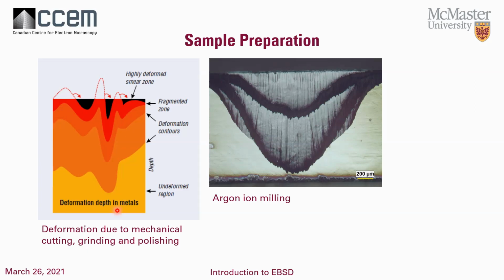You need to prepare the sample so you're down to this level in the material. So things such as cutting, grinding, and polishing can all introduce damage or can help take some of the damage away. But you have to keep in mind that you've got to do sequential removal of the damage down to a level where you're not getting a deformed region.